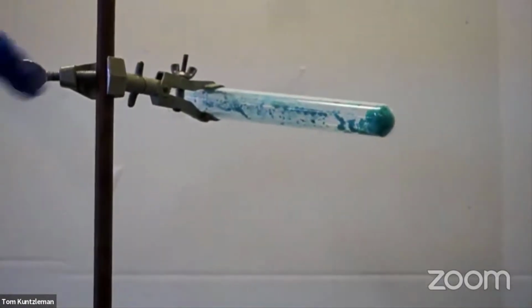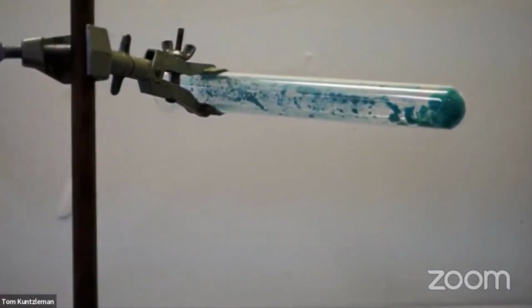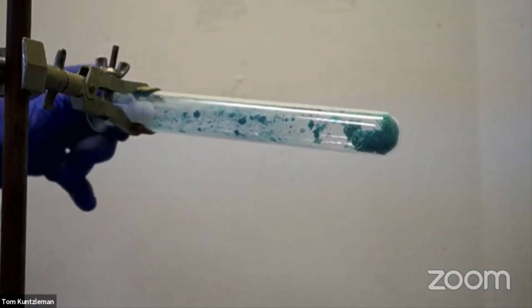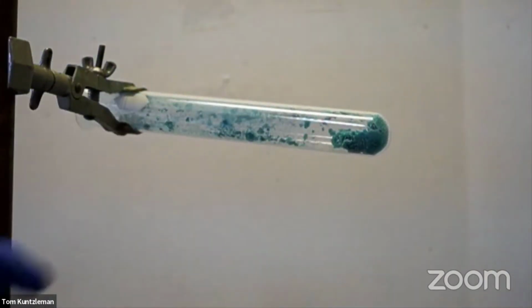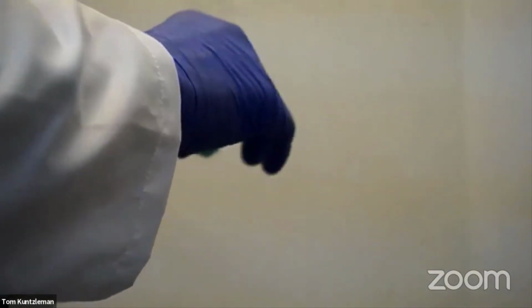Let's look at this particular test tube real closely. What do you see? Well, let's pay attention to the color. I see some blue-green colored stuff in my test tube. Do you? Yep, I do. And that blue-green colored stuff tells me that there's copper-2 in there. It's a compound that actually has copper-2 ions in it. This particular compound happens to be called copper-2 formate.